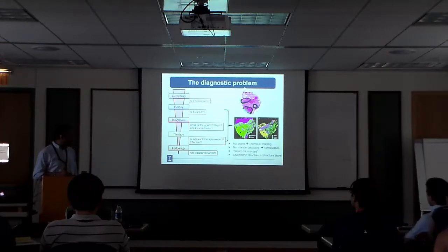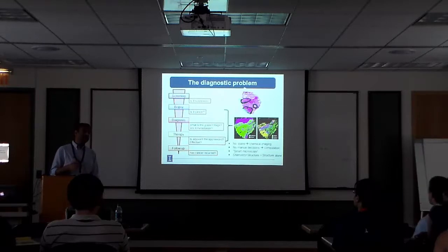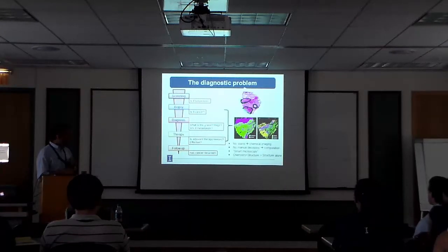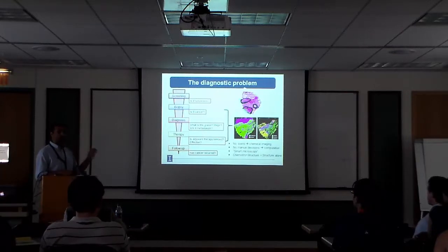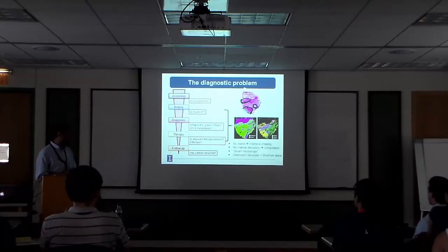The second thing, which I'll show you in a few slides, is that the way we're getting this image is not dependent on the morphology of the sample, as most imaging techniques and as human recognition is dependent. It's actually dependent on the underlying chemistry in your sample. What I'll show you in the next few slides is that in these kinds of images, every pixel has an associated spectrum with it. The spectrum could be infrared or it could be Raman, which are the two modalities in our lab.